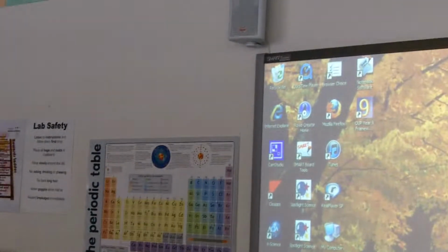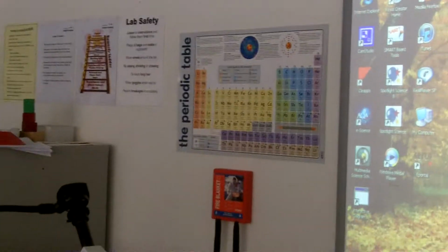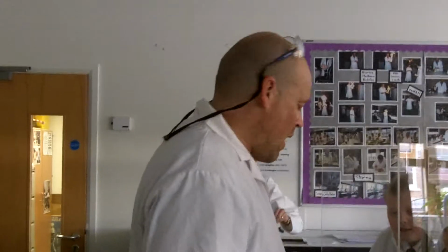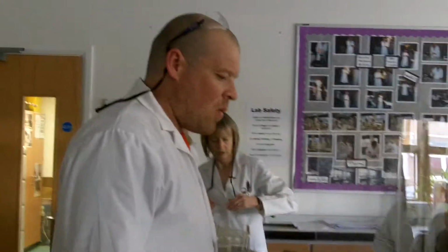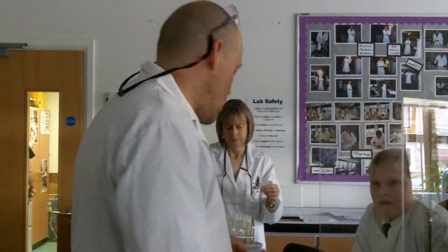Just up there, guys, you see a periodic table. What we're going to be looking at is the first column there. They're the alkali metals, okay? And they are very, very reactive. I'm going to show you how reactive they are, because I'm going to just throw some in water. They react quite vigorously in water.